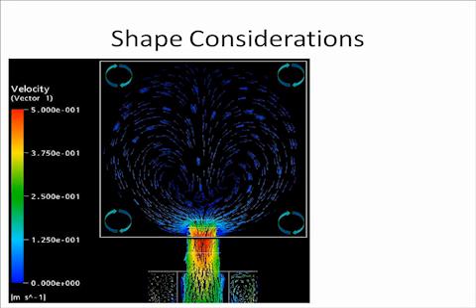What happens is, instead of there being mass flow due to turbulence in the chamber between these pockets and the bulk air in the chamber, it winds up being diffusion, and diffusion is a slower process.